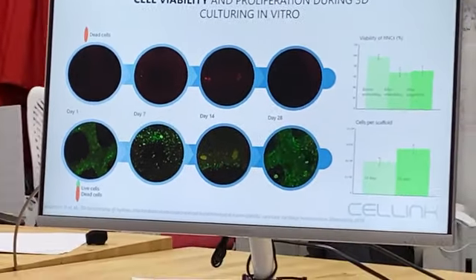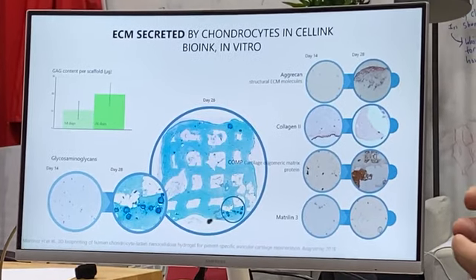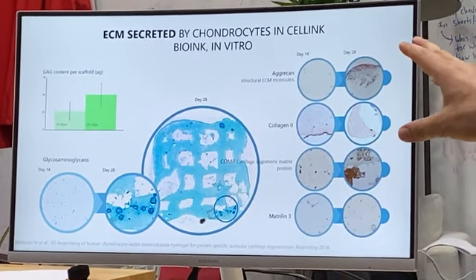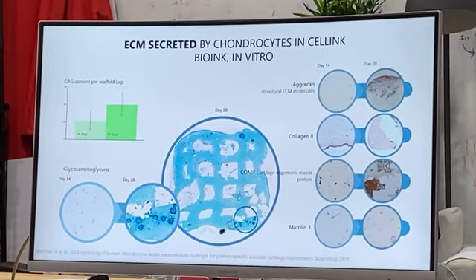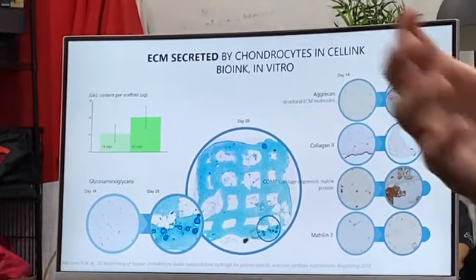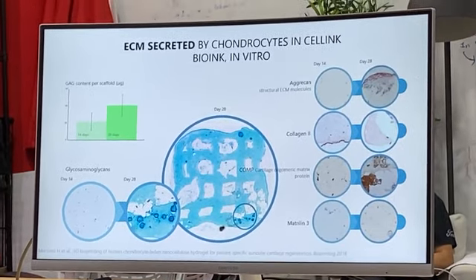with the live/dead test. And to guarantee that the tissue starts to secrete extracellular matrix. That is the most important thing, because that guarantees that the tissue is working as you want, and all the molecules are being created by this tissue, right? Well, the ECM is how cell-to-cell communication happens too. So without that, you don't have... Exactly. Those molecules bring the communication between the cells, like aggrecan, collagen, matrilin. That is an example, but there are many things that happen inside of a tissue.